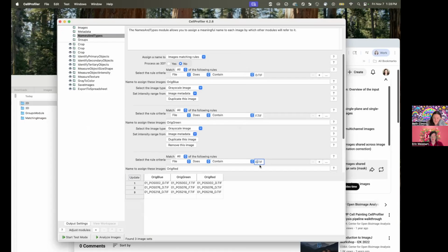It's really important because otherwise you might think, ooh, there's a change between my green and my red. That isn't actually a change between green and red, it's a change between green and blue. So the downside of all of this is this is a place to be really pedantic and really careful. It's good to do sanity checks when you're looking through these.